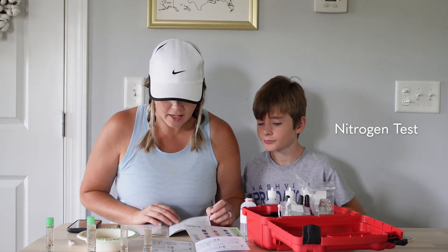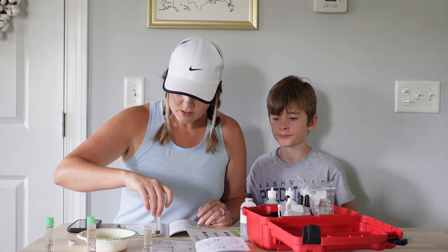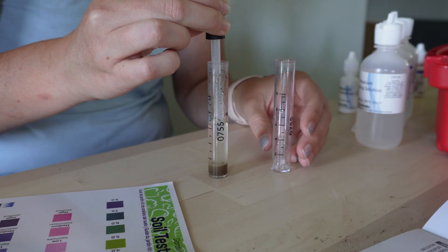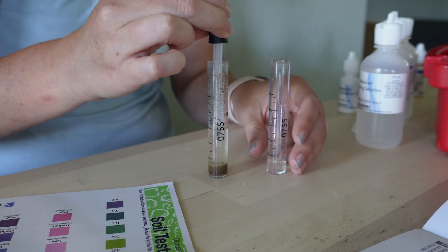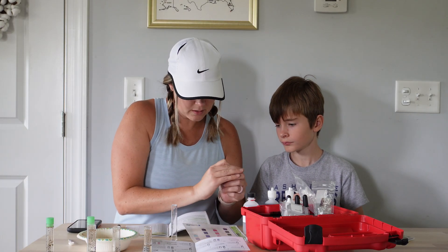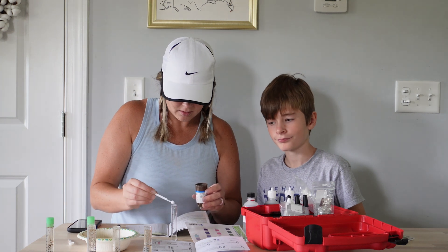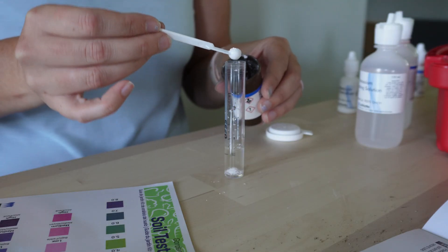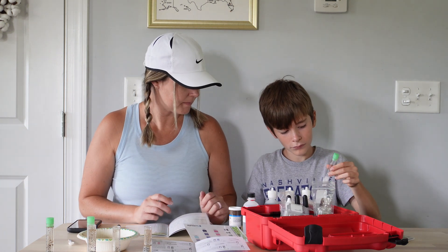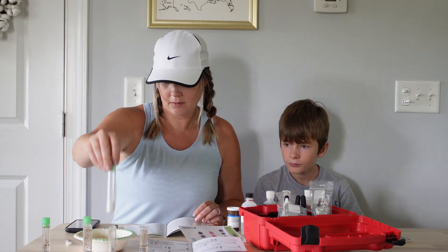Next is nitrogen. Use a clean pipette to transfer clear liquid to a second test tube, avoiding agitation of the soil. We need two of those, pour it in here. Cap it and gently mix. So this is nitrogen — now we have to wait five minutes for the pink color to develop above the powder line.